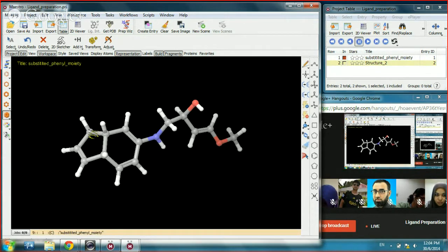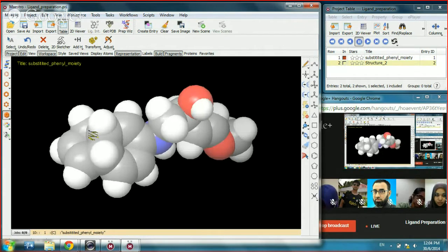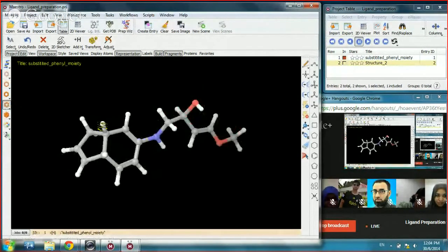Space fill, you go to space fill and click this one. You see, wow, it becomes very bulky. Sometimes you may need to show the structure in this form. At that time you can change the style of the structure from here, right? Okay, we go back to normal size again. This looks better, yes, or this one looks better? Which one?